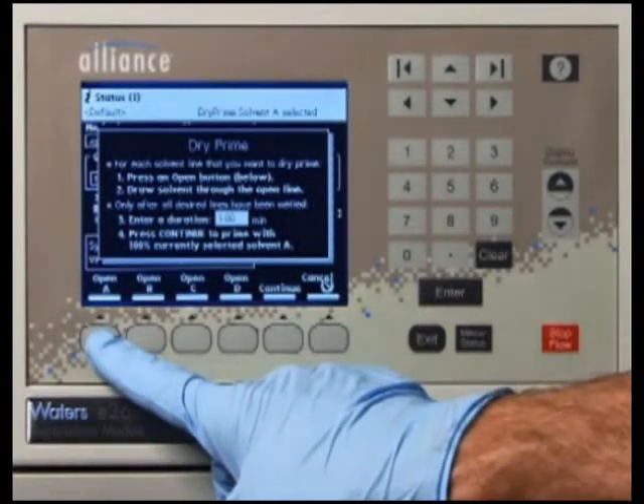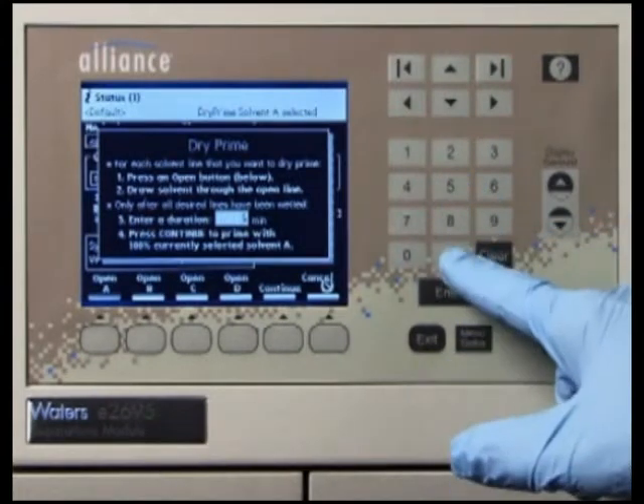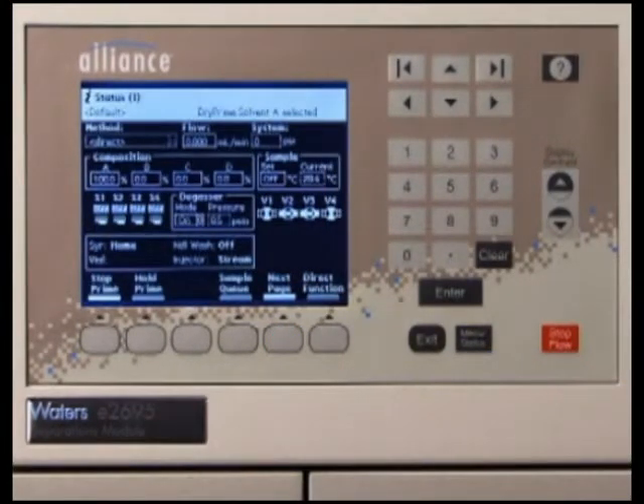Press the screen key corresponding to the solvent line with which you want to prime the system. Waters recommends that you prime using the solvent with the lowest viscosity to help purge air from the lines, especially if the inline vacuum degasser is installed. In the Enter a Duration field, enter the length of time in minutes to prime the solvent management system. Start with a value of 5 minutes. Press Continue. The solvent management system begins to operate. At the end of the priming period, the solvent management system turns off and the separations module enters the idle mode.